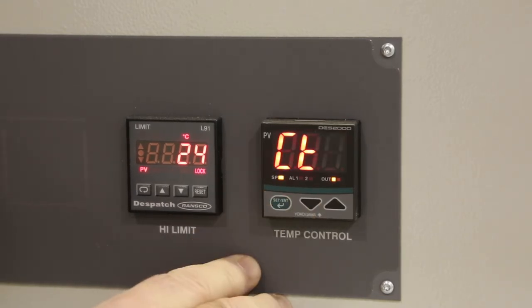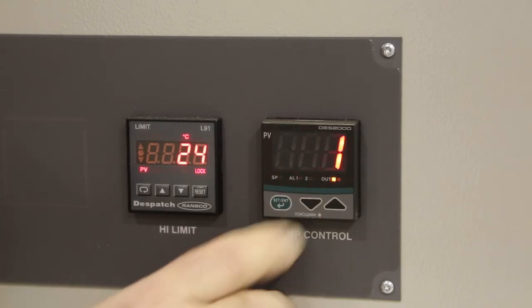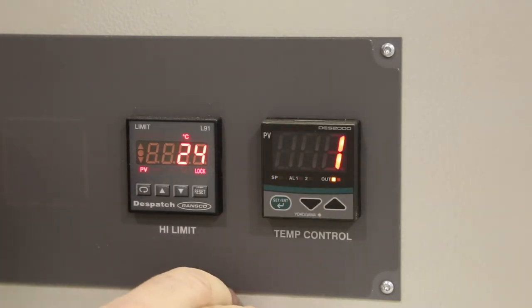Cycle the green button until you see CT for cycle time. Push the down arrow to make the cycle time 1.